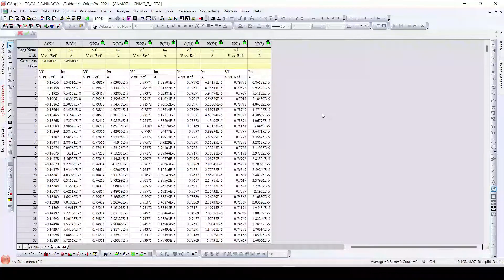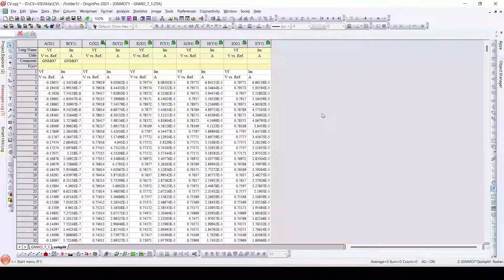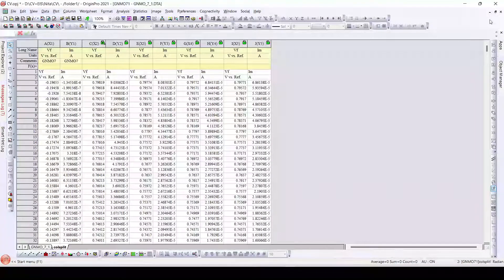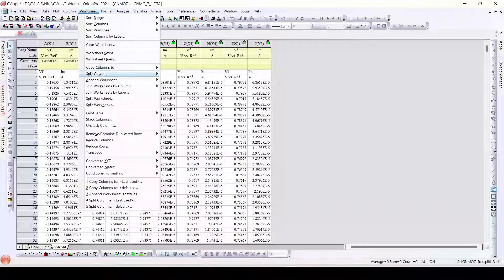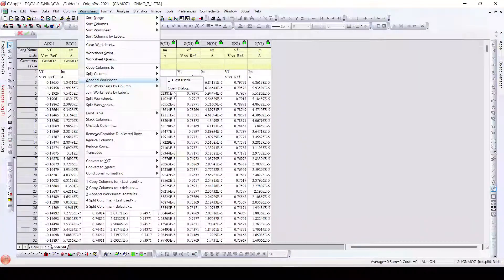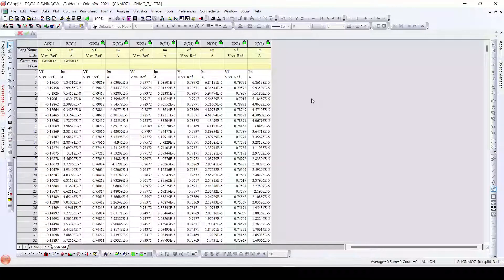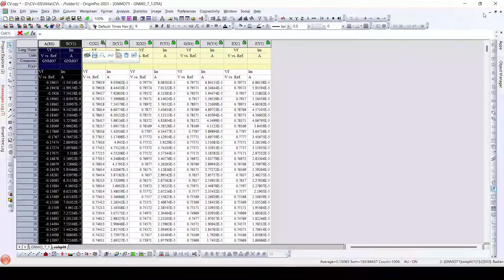Today in our video we are going to learn to copy the columns into a single worksheet. We have also learned to append the worksheet, but this is different from appending a worksheet. In append worksheet, what we do is we need a single worksheet already present, and then we go to worksheet and use the append worksheet function to append different worksheets into that particular worksheet that is already available. But what if we need a new or blank worksheet and we need to add different columns from different worksheets into it?